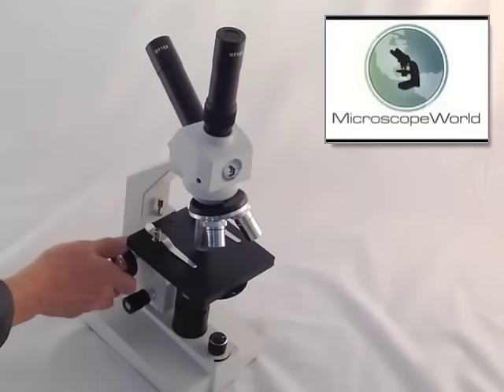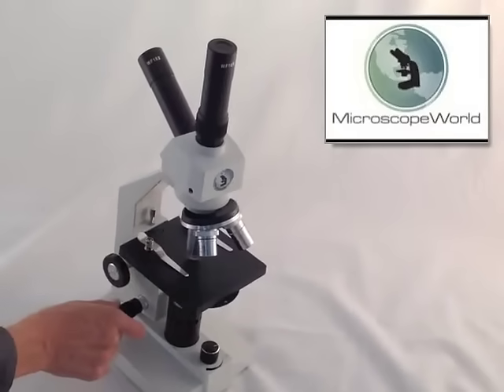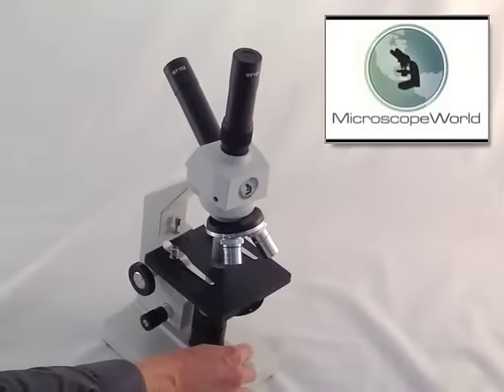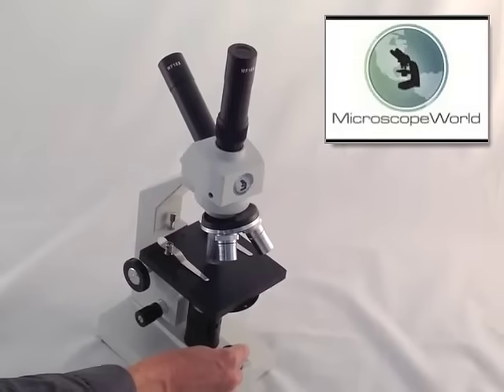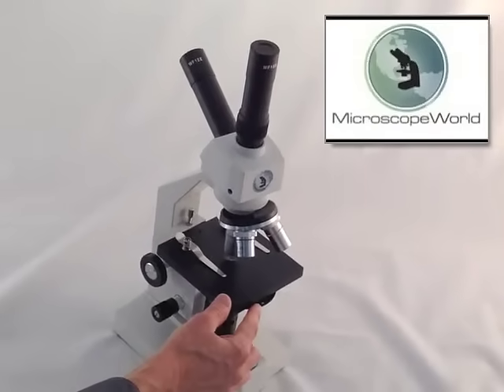There is fine and coarse focusing. The coarse focus brings the stage into approximate position and the fine focus gives you really sharp resolution of your images. There's an LED illuminator with variable intensity. The LED lasts for a long time and won't heat up your specimens if you're looking at live objects.